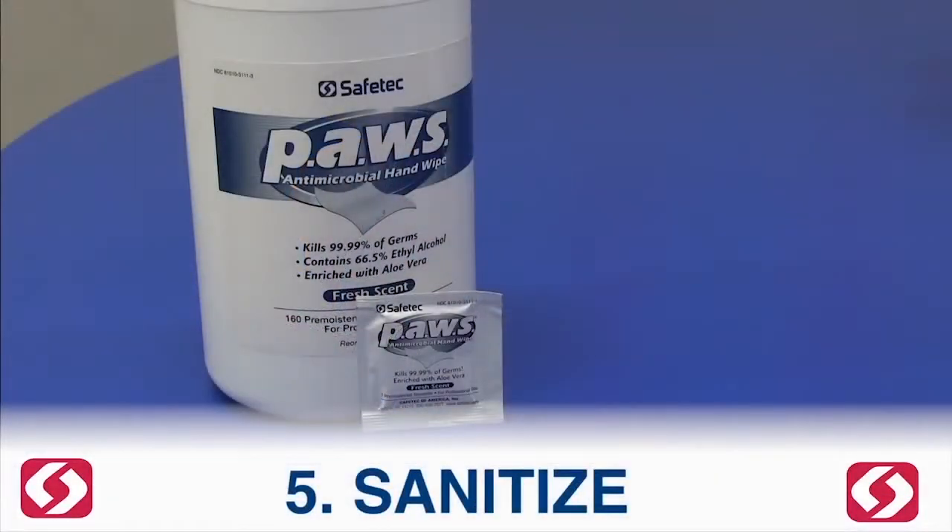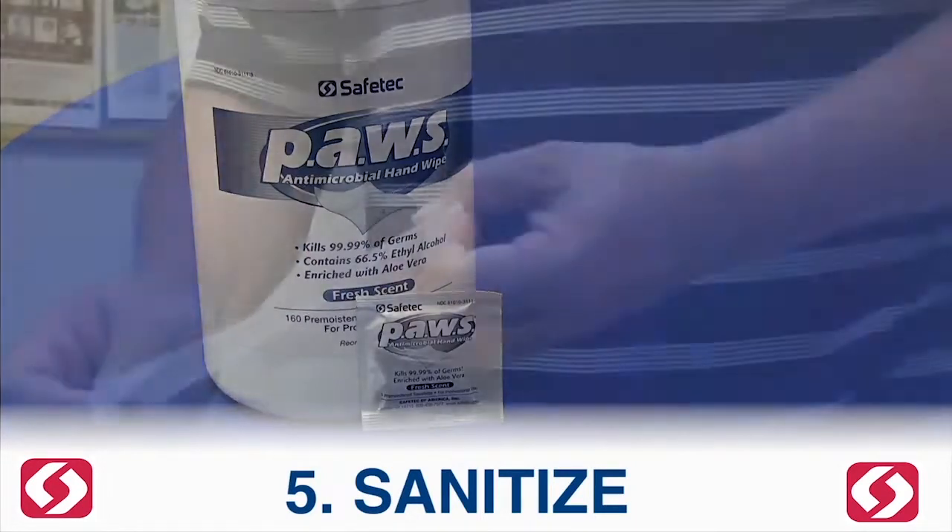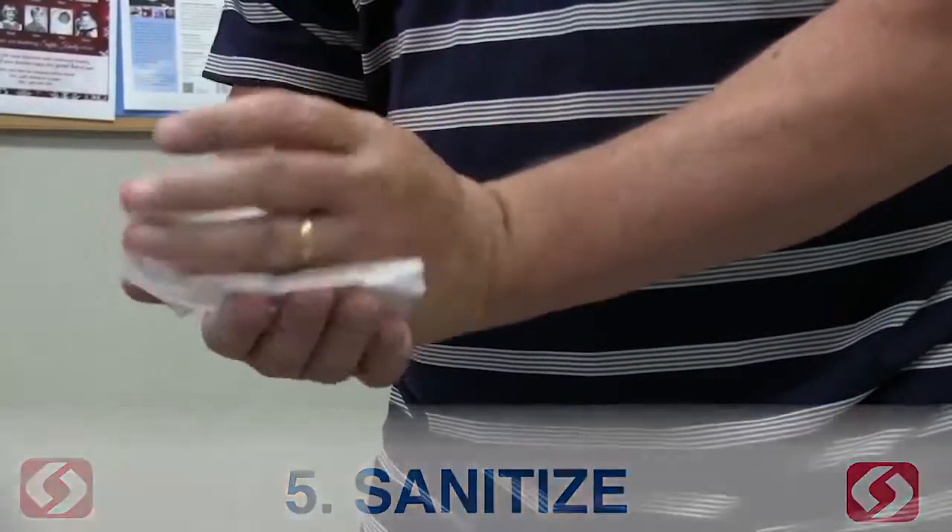Sanitize. Use the P.A.W.S. wipe to sanitize hands, and use soap and water after cleanup is done.